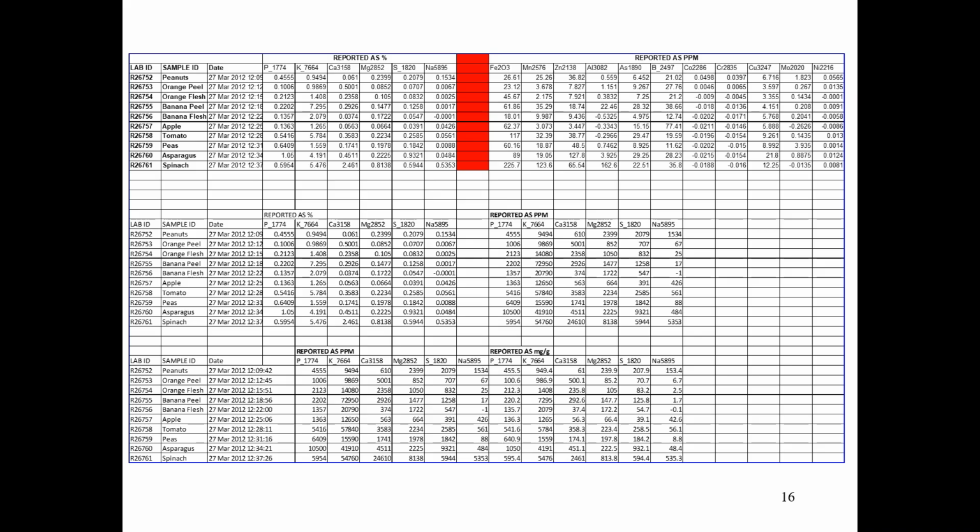Yeah, you cut it with a knife, or there is a machine, like a blender. Oh, like a food processor? Yes, I have one in the lab. So we cut them and chop them in small pieces, then we digest them to put them into solution, and so on. So you can see all those kinds of things.